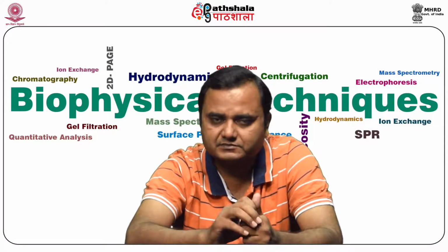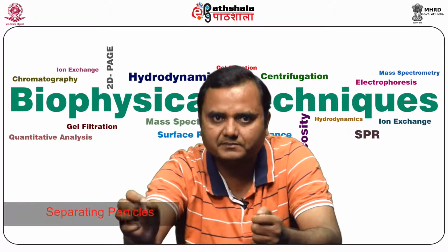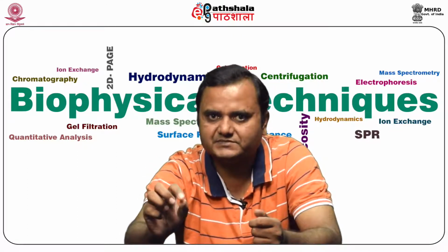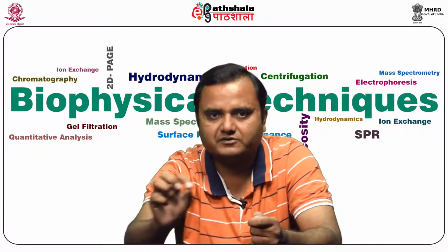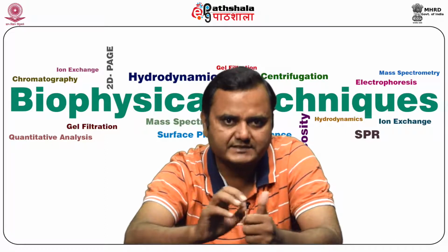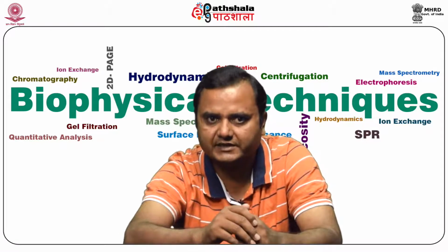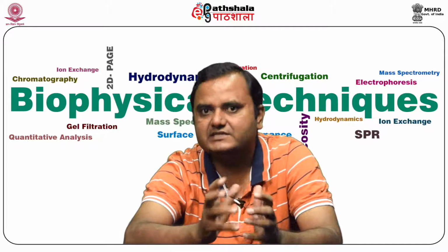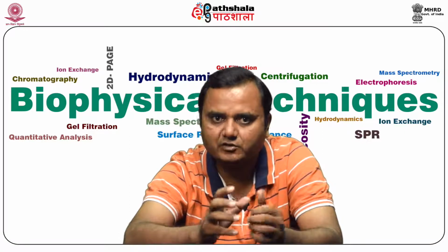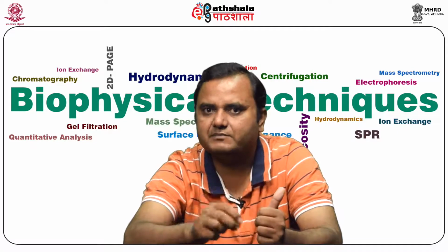So the basic concept of centrifugation is that a centrifuge is a device for separating particles from solution according to their size, their shape, their density and the viscosity of the medium, and of course the speed of the rotor. In biology, the particles are usually cells, subcellular organelles, viruses, and large molecules such as proteins and nucleic acids. The separation of these molecules depends upon the sedimentation coefficient of the particle, given by Svedberg, and known as the Svedberg unit.